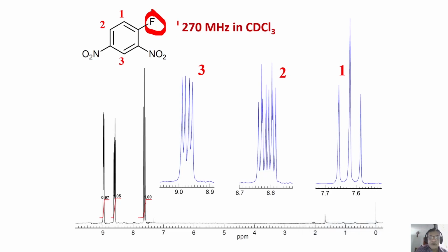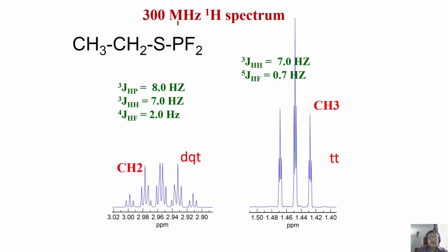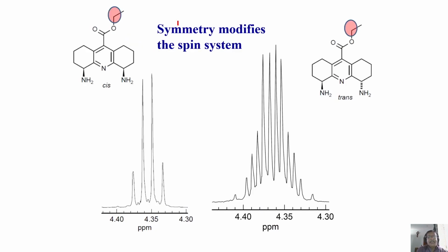So, okay. So, what I'm going to do is I will give another simple example of the heteronuclear coupling. I will not do this. We'll come to that later. I'll give you a trick of the example how sometimes spin system gets simplified because of symmetry.